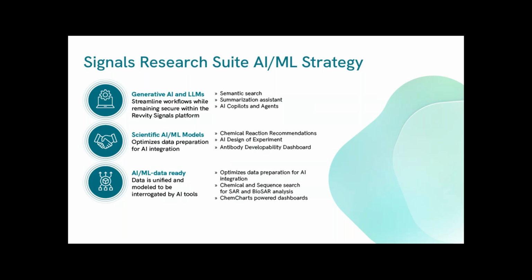This first one strikes my fancy. Does the image analysis also work for particle analysis, form factor analysis, like roughness, colloidal particles? It's kind of like a material science question, I think, in some regards. Is this mainly cells, or does it also work for particles? I'll answer that question, but probably not exactly answer that question. It is made for cells. It is specific. That was its goal.